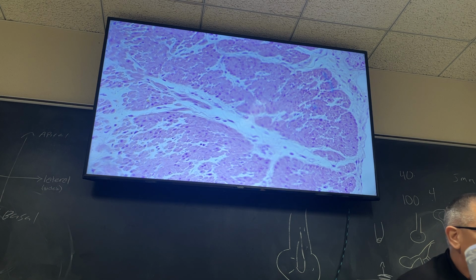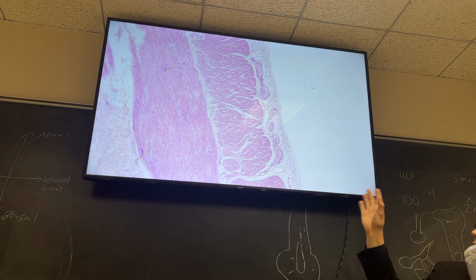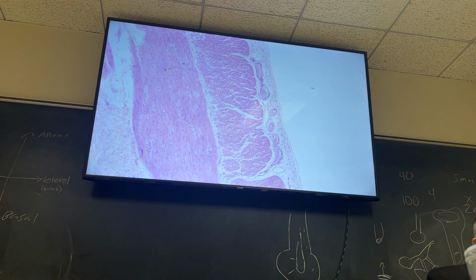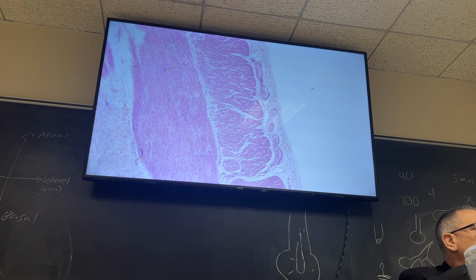All right. Fairly easy, smooth muscle. Okay, I'm going to go back to my lowest power here again. Where's the only place you're going to see this? Where do you see 2 layers of smooth muscle, one longitudinal, one cross-cut? Stomach. And 2, say that? Intestine, very good.